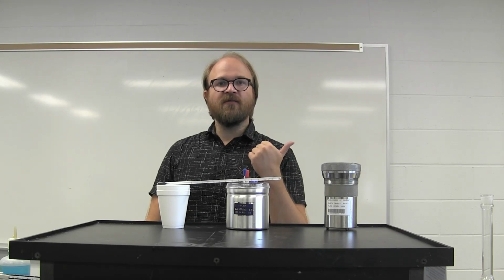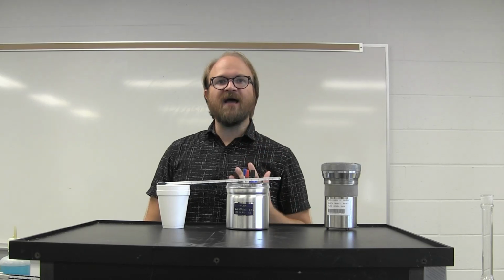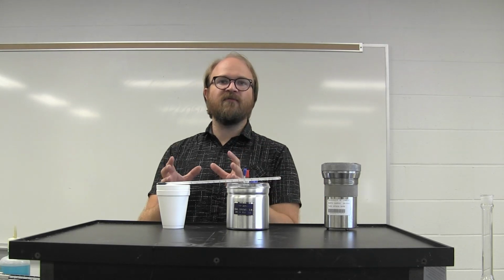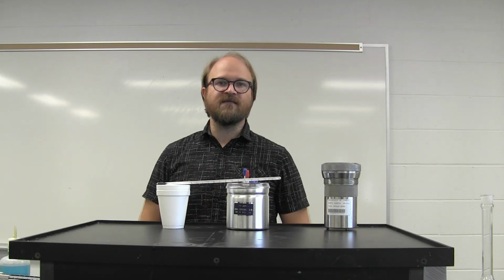From the change in temperature, the mass of the known material, and the material itself, you can determine how much energy was transferred from the reaction or the process into that material that causes a temperature change.